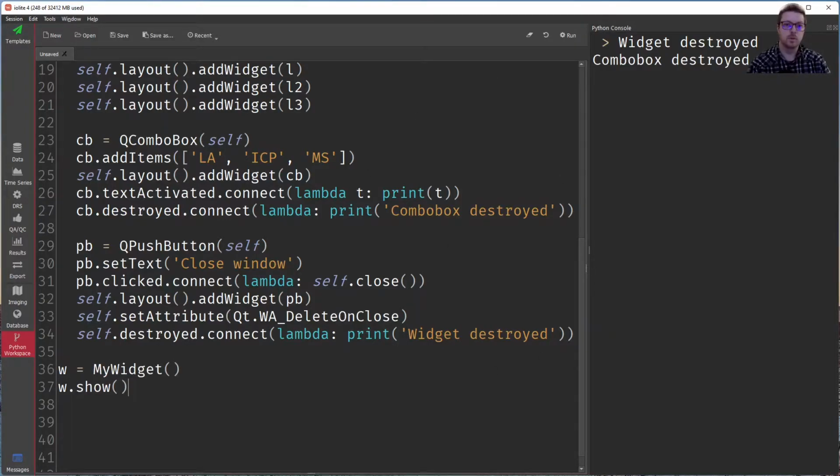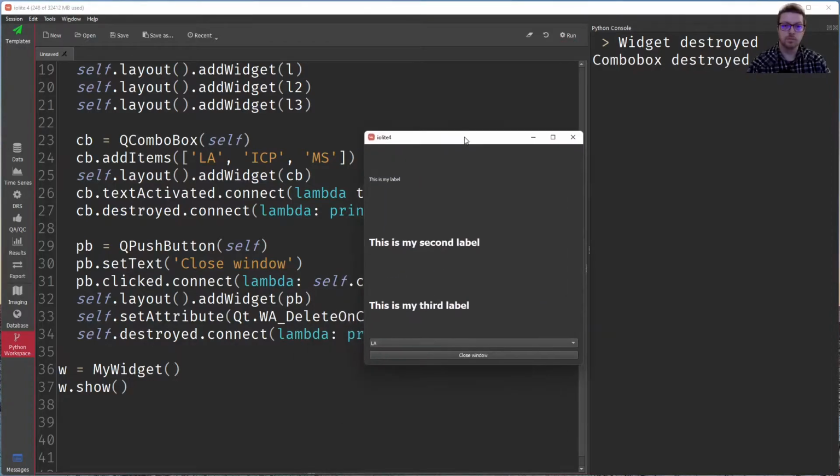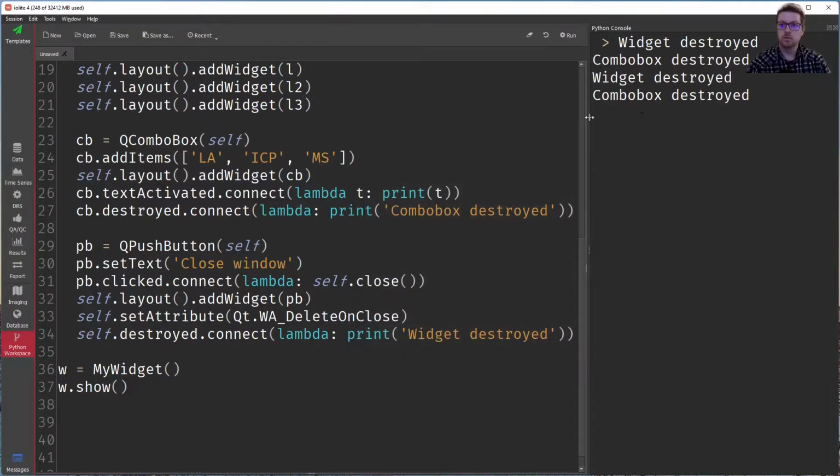Let's see if I missed anything. Run. There. And close, and things are destroyed.